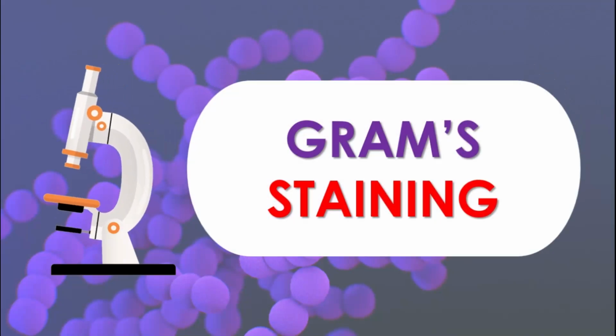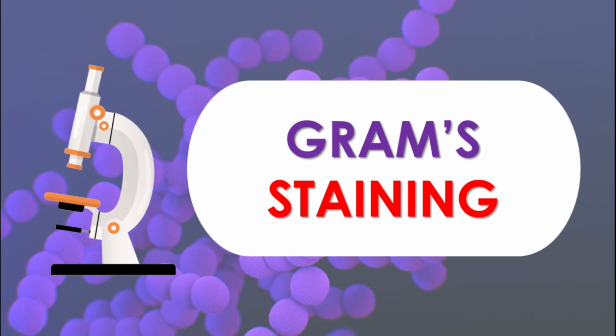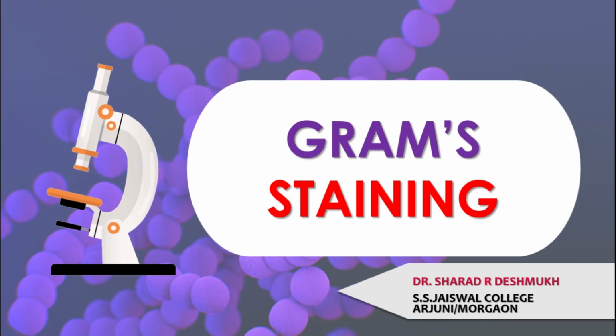Today we will continue the staining technique. Today we are going to study the gram staining technique. I am Dr. Sharad Deshmukh from SS Jaiswal College, Arjuni Morgaon.